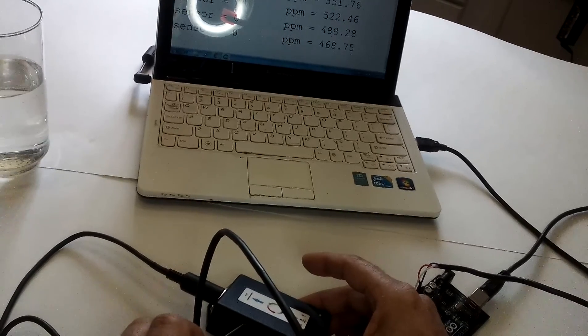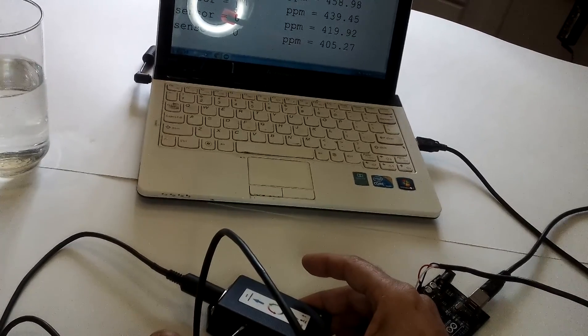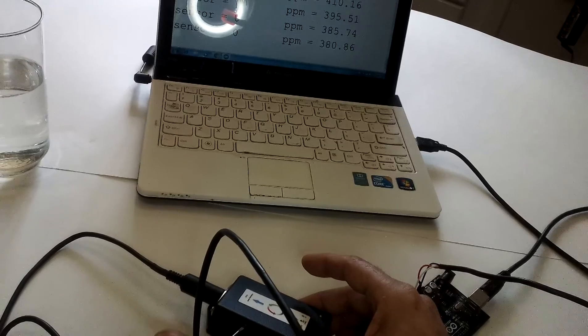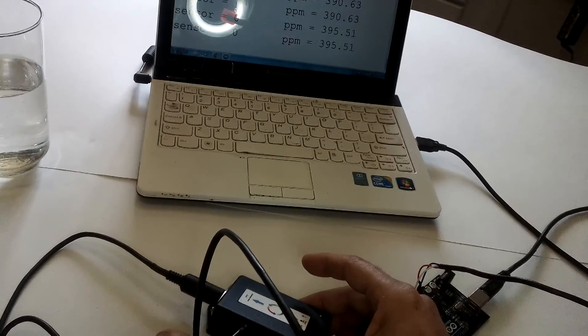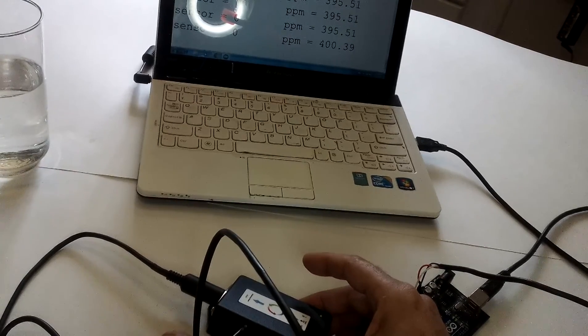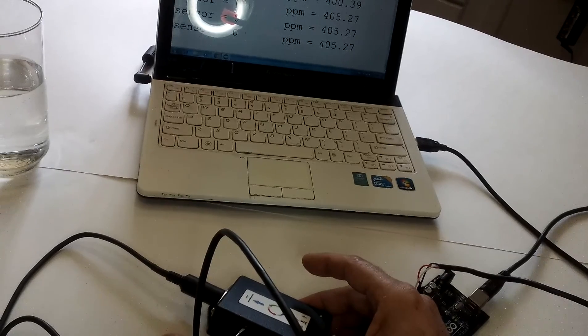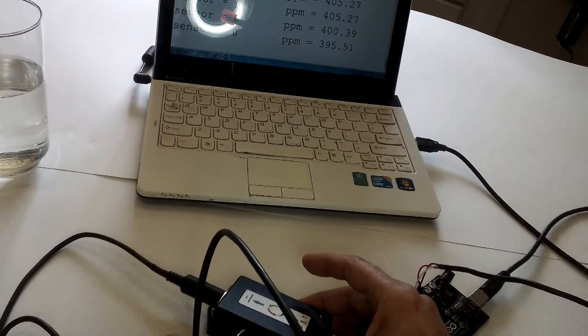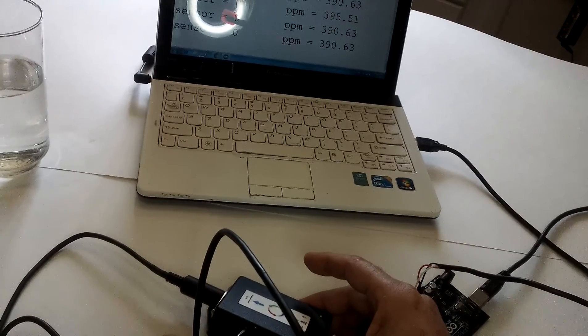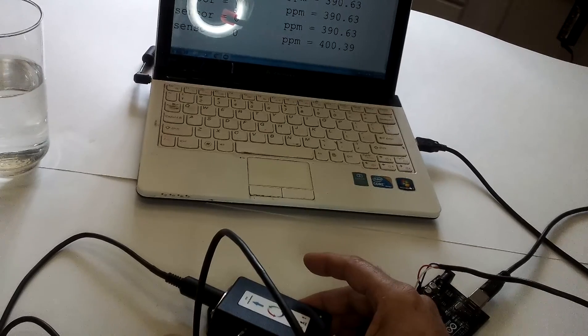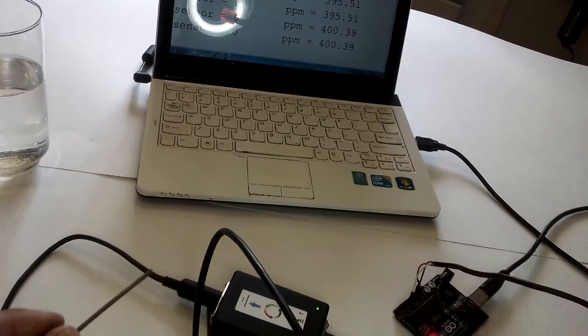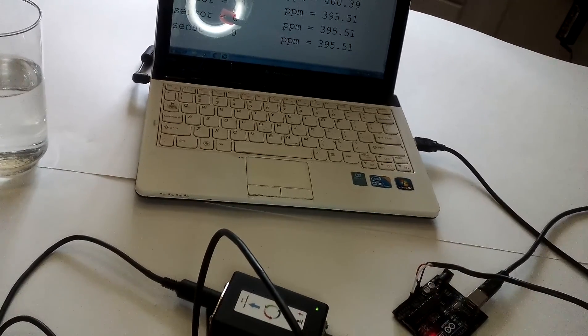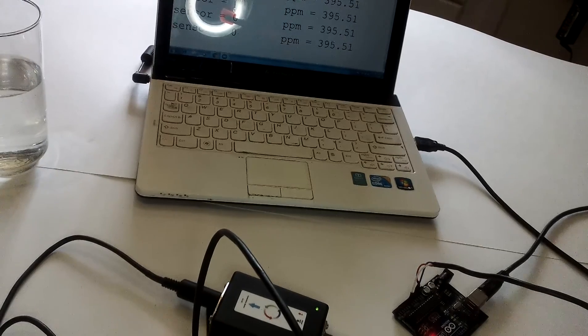Because remember this was microsiemens, now we're reading ppm, 396. Okay. It's about there. Alright. I've got 395.